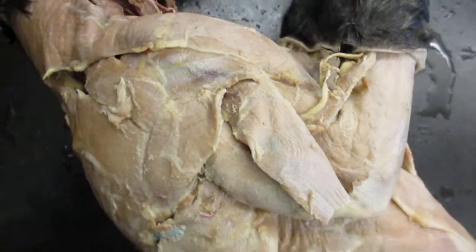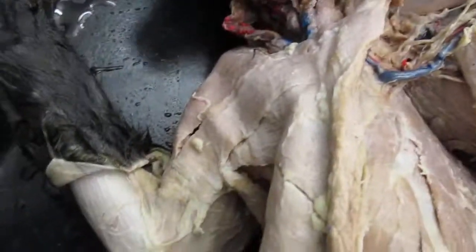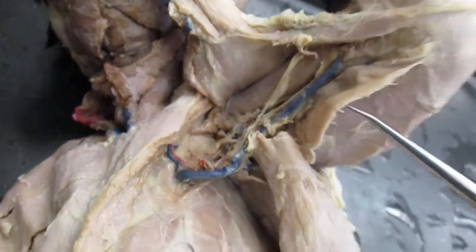Is right here. And we have the biceps brachii right here. And an epitrochlearis muscle, we can see that right here. So here's your biceps brachii, and then your epitrochlearis is right there. And that's it.